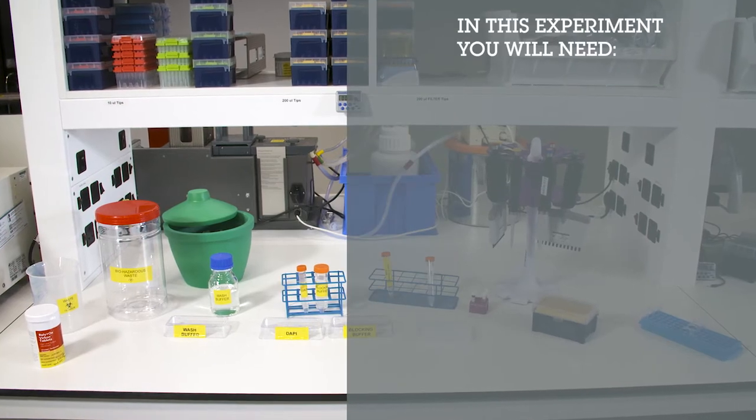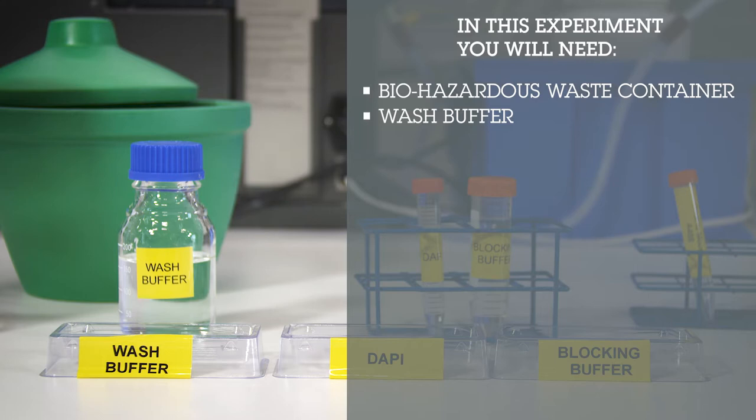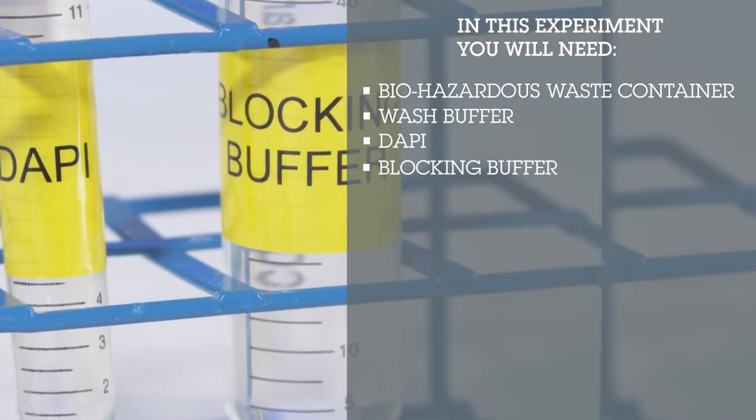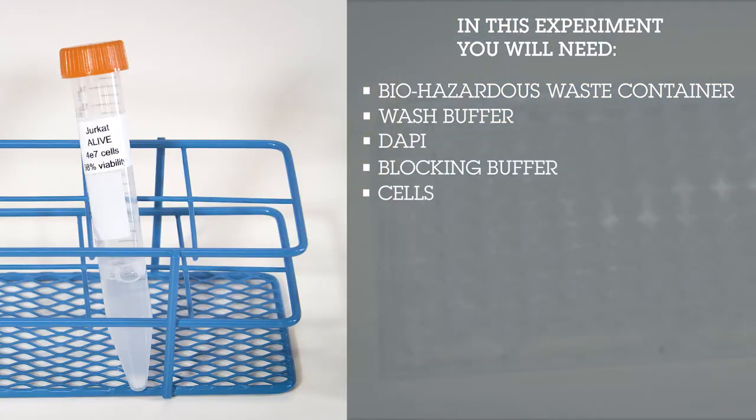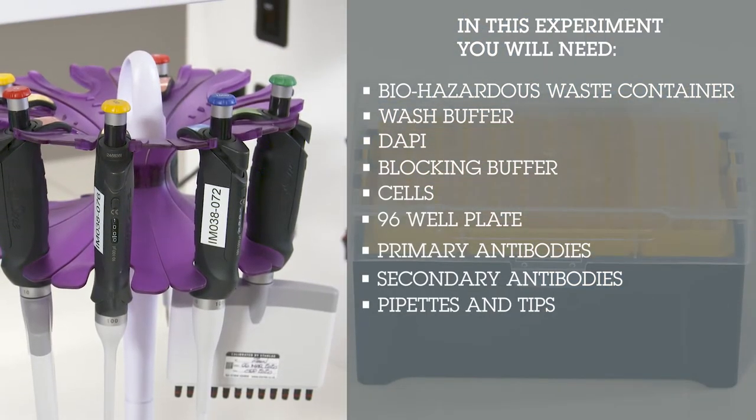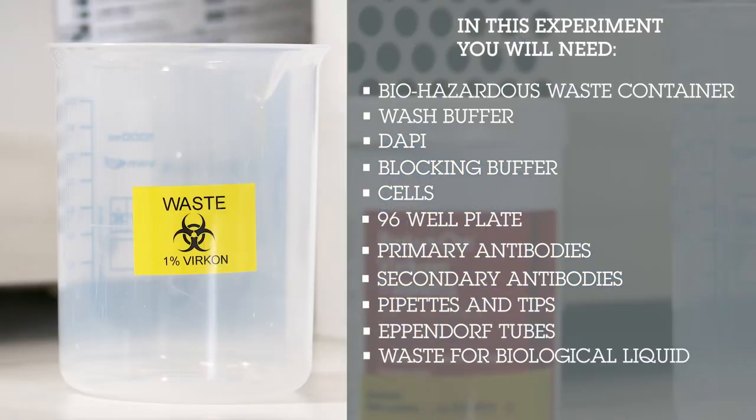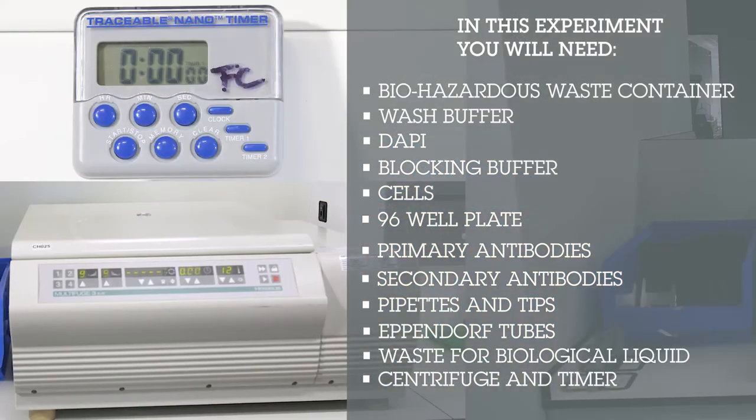What you will need is a biohazardous waste container, wash buffer, DAPI, blocking buffer, cells, 96 well plate, primary and secondary antibodies or conjugated primary antibody, pipettes and tips, eppendorf tubes, waste for biological liquid, a centrifuge and timer.